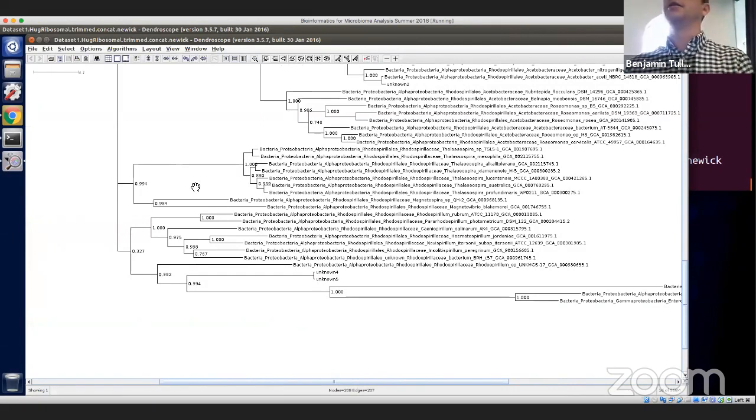We'd have to ask Elena to double check. So are they really unknown and don't have? No, those are known. They're known. You just didn't include their references. Yeah. Okay. Great. Cool. So that would be how you look at the tree.